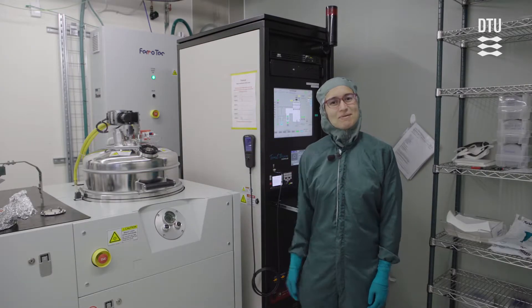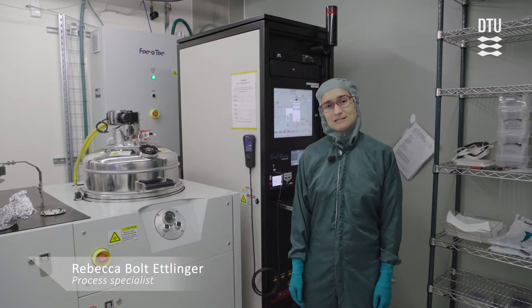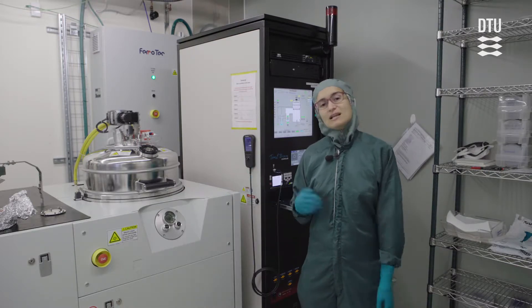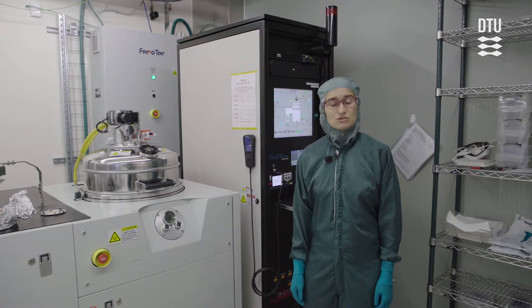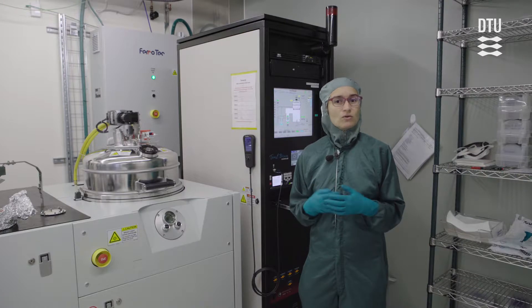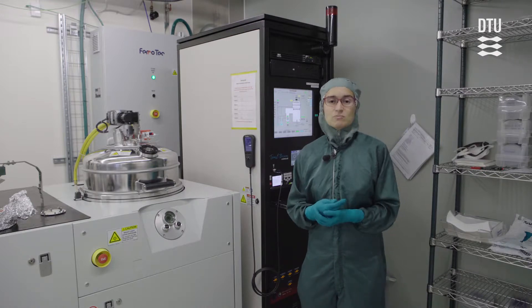This is the Temescal EVAM evaporation system. Its main purpose is the deposition of thin films of metals, usually tens to hundreds of nanometers thick. It's a relatively quick deposition system. After you load your samples, it takes about 20 minutes to pump down the load lock, and usually your process will only take, from start to finish, about 45 minutes, perhaps up to an hour, depending on what deposition you're doing.